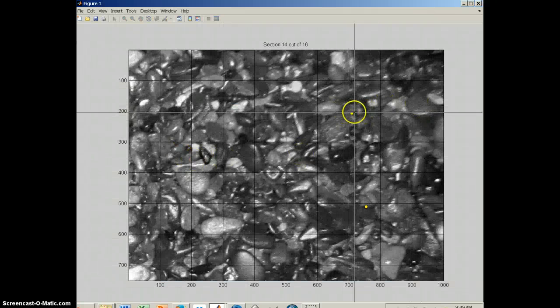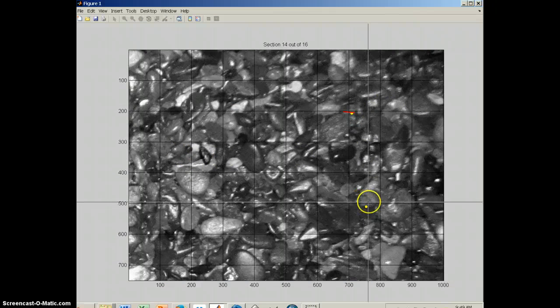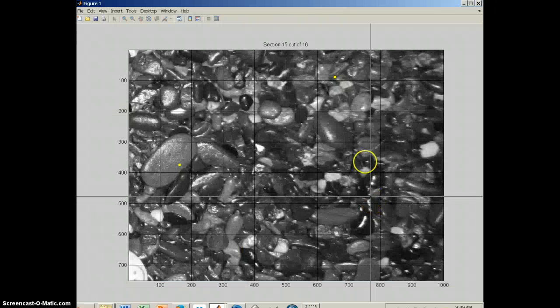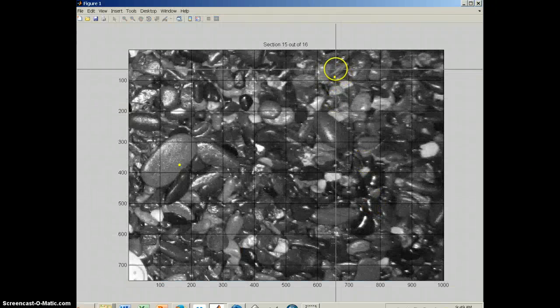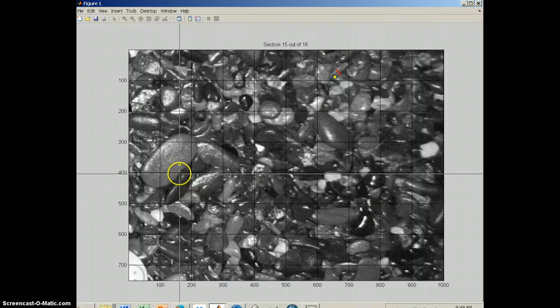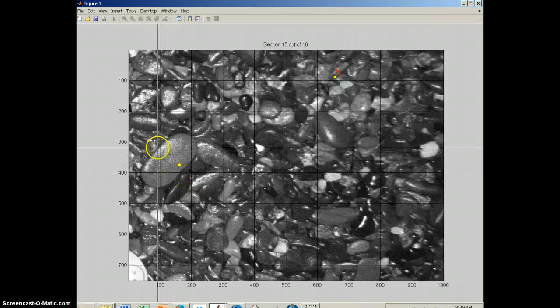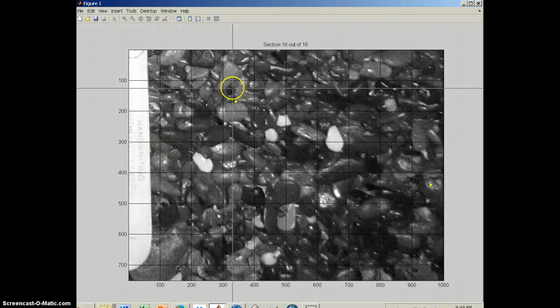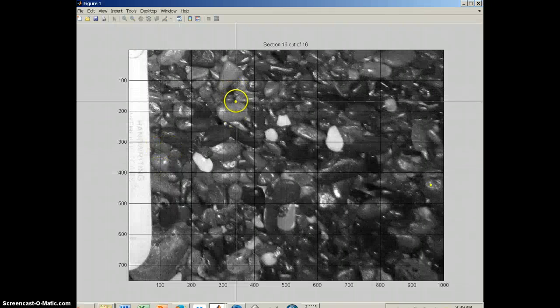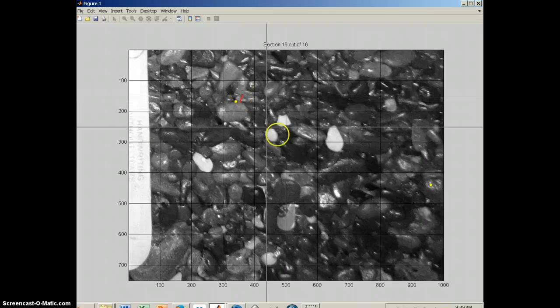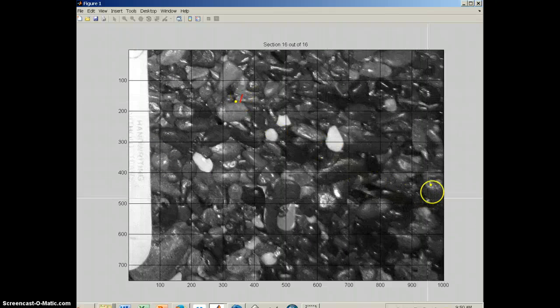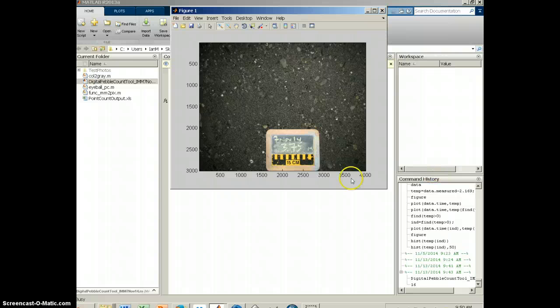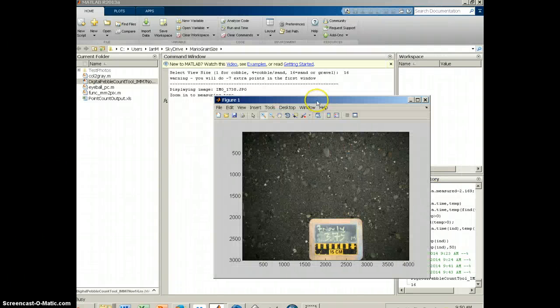Almost done with this first photo. This, I think, is the last one. Okay, so that's the first photo, finished it up.